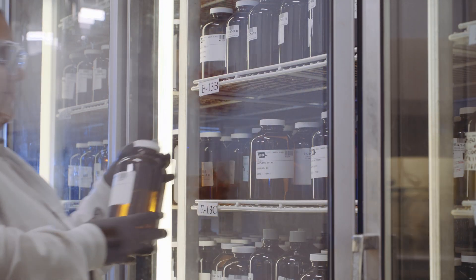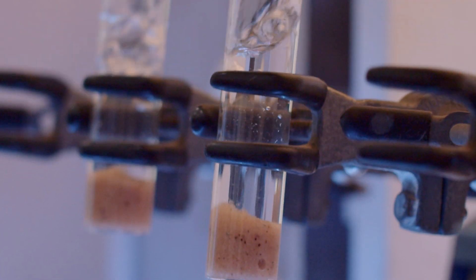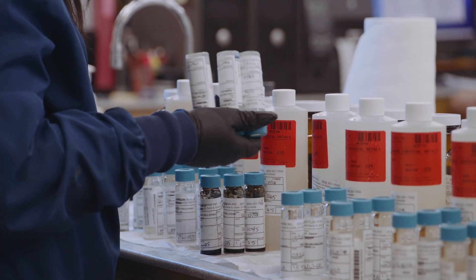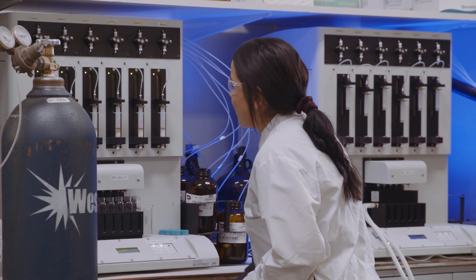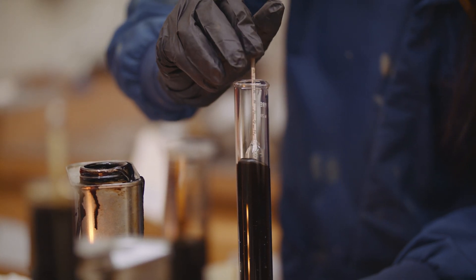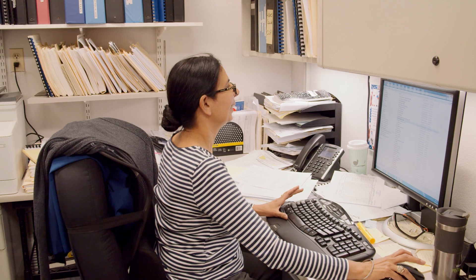Probably the first lab I ever dropped a sample off to was BC Labs. I have appreciated the fact that I have a local laboratory where I can get sample supplies, where I have a chemist that I can speak to about a certain analysis. I have a customer service rep that I can meet with.